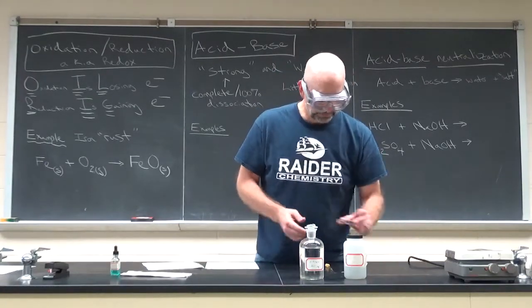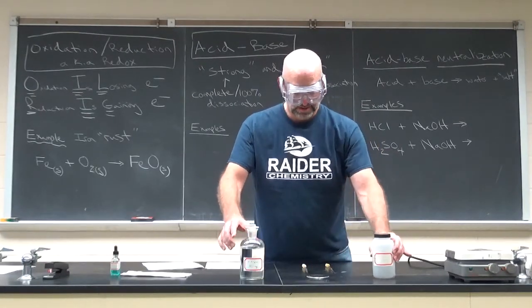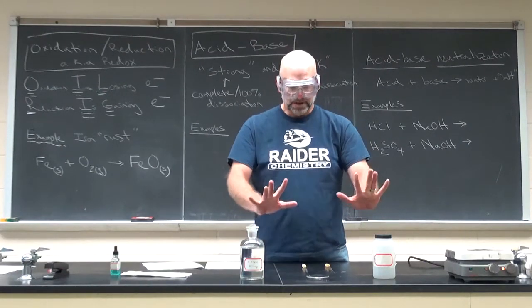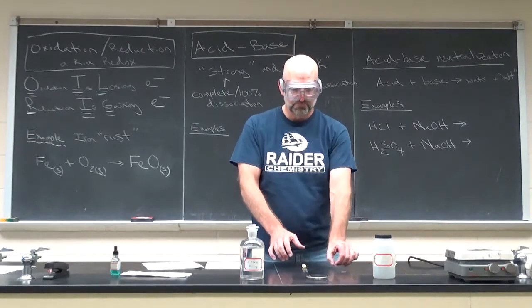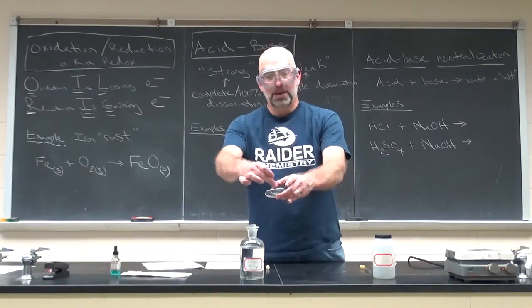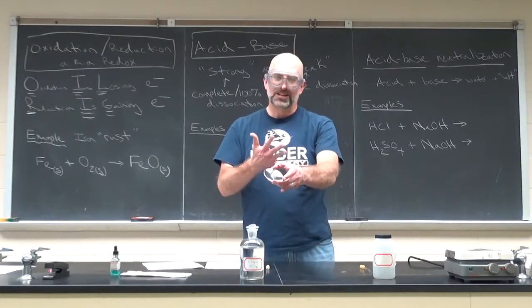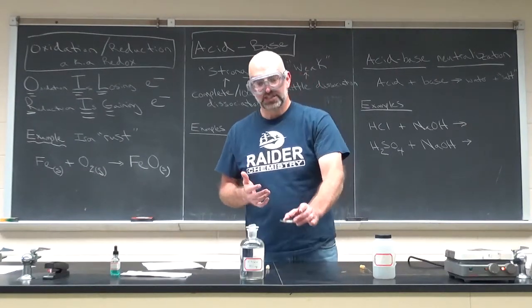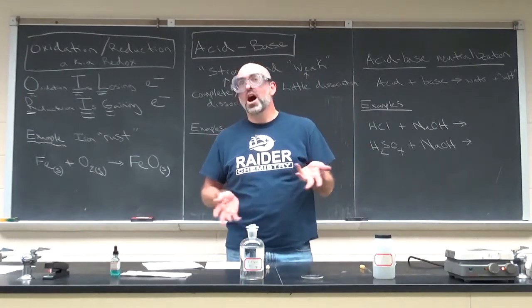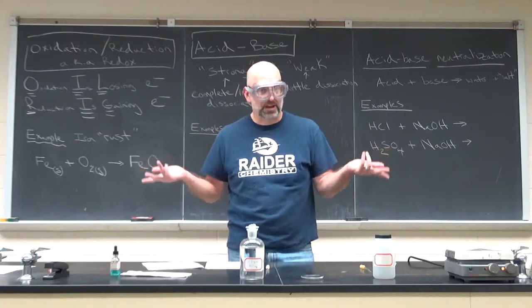So what we're going to do is put a little bit of each. Now these are very concentrated, so these are actually pretty dangerous solutions to handle in the lab. But I'm just going to do small amounts. I've got a disposable pipette for each, and I'm just going to put a few drops of each, I don't know, 5 or 6, less than 10, here in the middle of this watch glass. You won't see much happen right away. In the procedure it says, add a couple drops and just let it sit there. Well, you're letting it sit there so that the water evaporates, and all you're left behind is something, or nothing. I don't know, we'll wait and see.